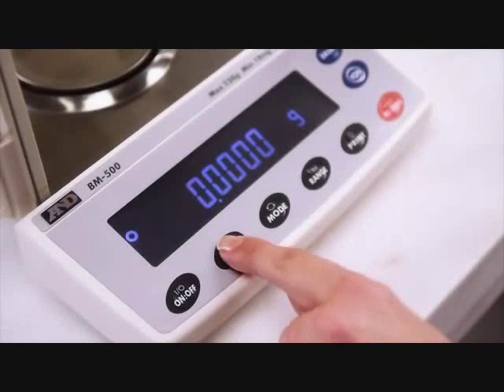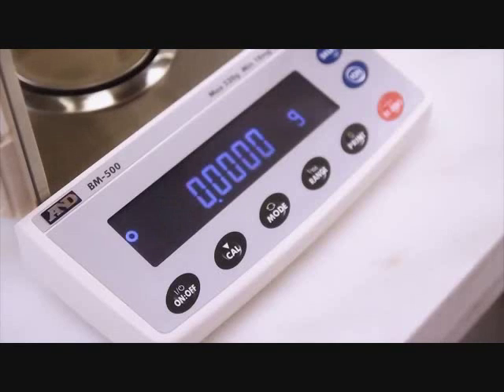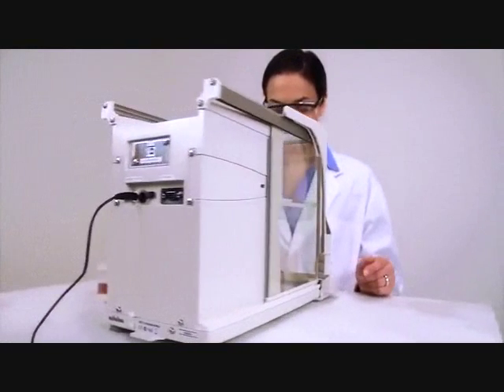Other standard features add convenience and capability to all six models. All BM models are compliant to these laboratory and industry standards. Internal calibration is built-in and always available with a single key press, or let the balance automatically self-calibrate in response to changes in the environment.